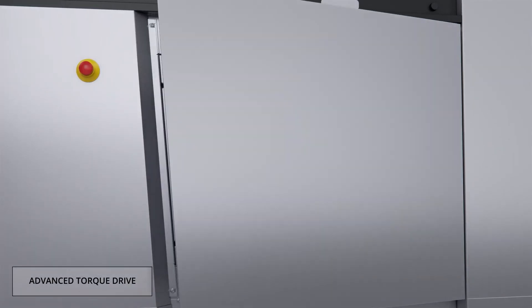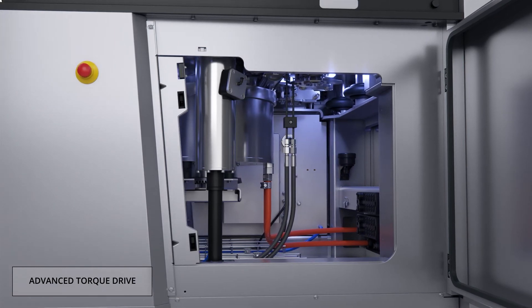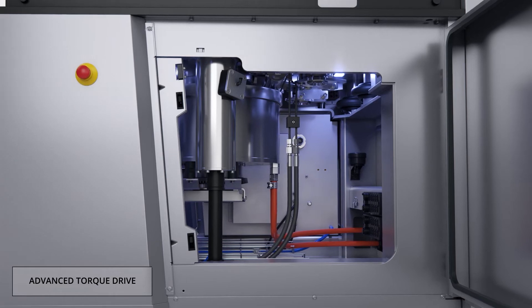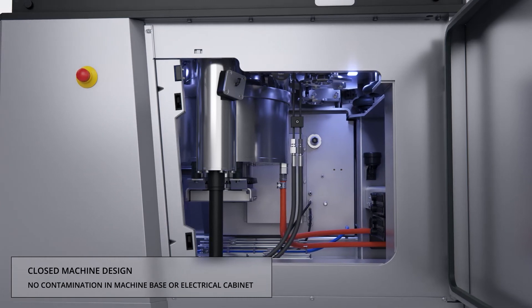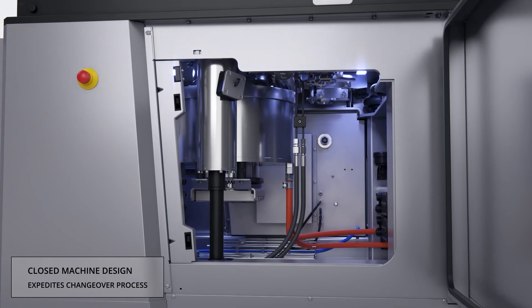A torque drive offers a high power reserve and allows high compression forces even at low speed. The water cooling serves both the torque drive and the heat exchanger of the electrical cabinet. The result is a fully sealed machine with no heat transfer to the compression zone of the press or to the compression room.